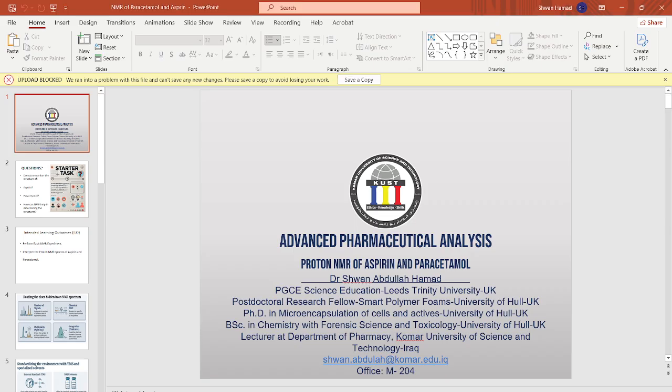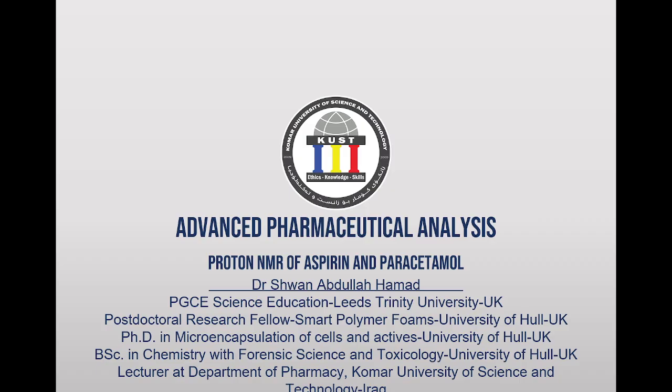We're going to do the practical side of it, lab number 5, I think. This is a special lab I made for you. I was planning to do this in two labs. Lab 1, just a simple experiment of NMR, then lab number 2, interpretation of proton NMR of aspirin and paracetamol, but because we don't have time and we don't know what's going to happen, we do both together. So we kind of need to be quick.